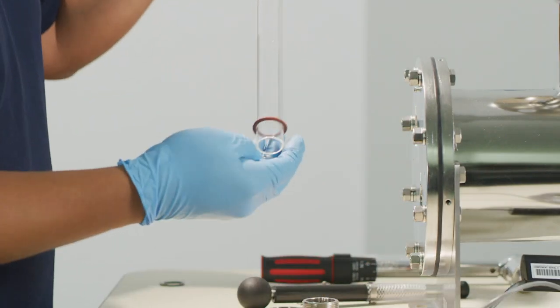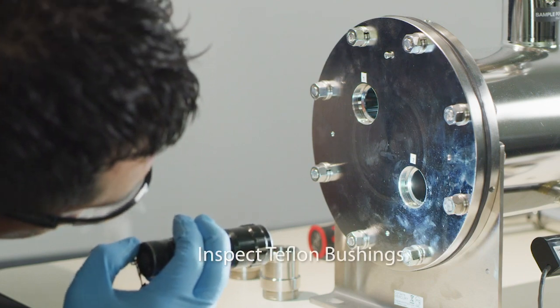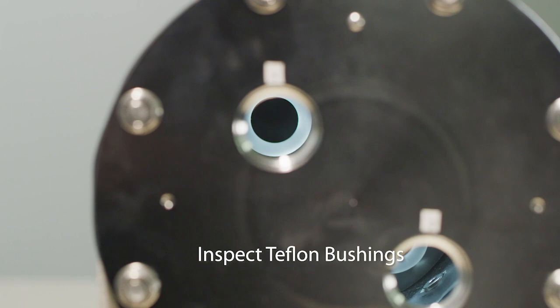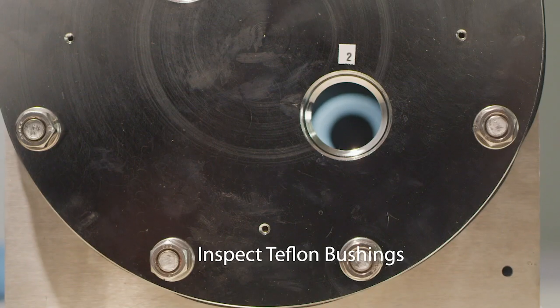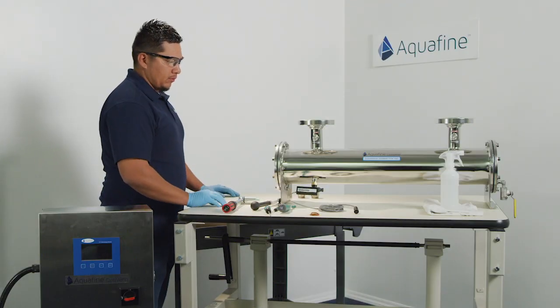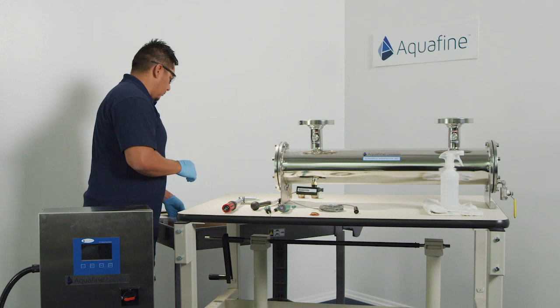Repeat process as needed. With the quartz sleeve removed, use a flashlight to visually inspect the internal Teflon bushings on the baffle assembly. Should one or more not be visible, the end plate will need to be removed to add missing sleeve bushings. When all sleeve bushings are accounted for, you can resume with the quartz sleeve and UV lamp replacement.